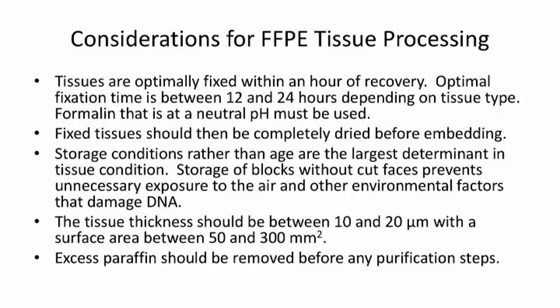So as far as considerations for FFPE tissue processing, again, I'm sure the challenges have been very well represented today, and so these are more some specific considerations that we've found to be very, very helpful. Some of them are very obvious. Maybe some of them will be helpful, so I'll put them up and go through them quite quickly. Not surprising, this is for post-surgical resection. This is really on the pathology side. This isn't the handling of already fixed tissue, but tissues really are optimally fixed within an hour of recovery. That has a significant influence on overall utility downstream from that, particularly for genetic studies.